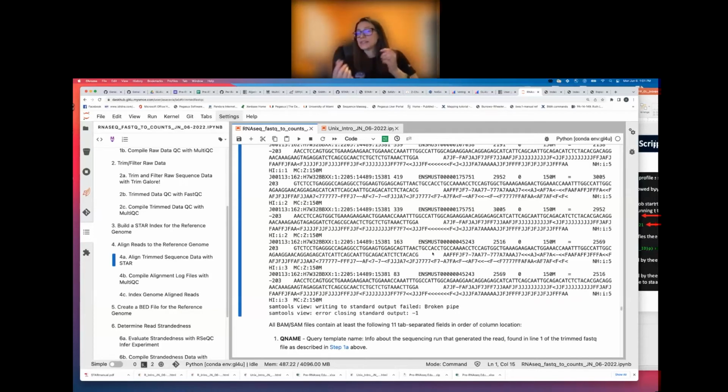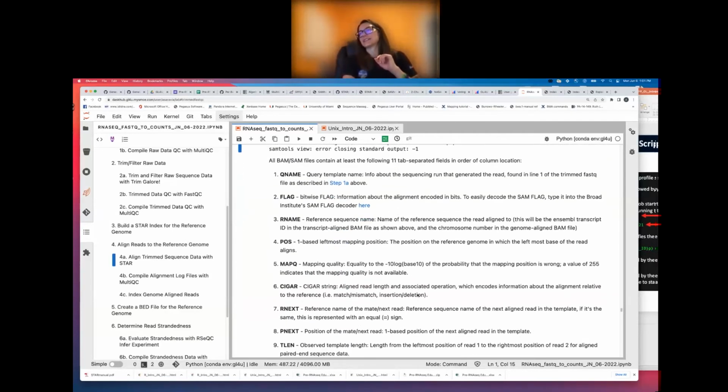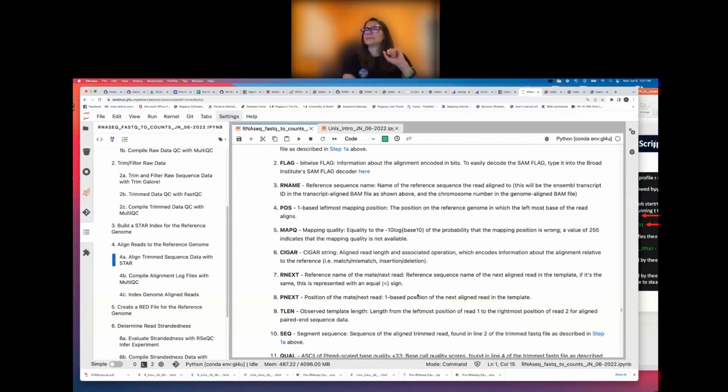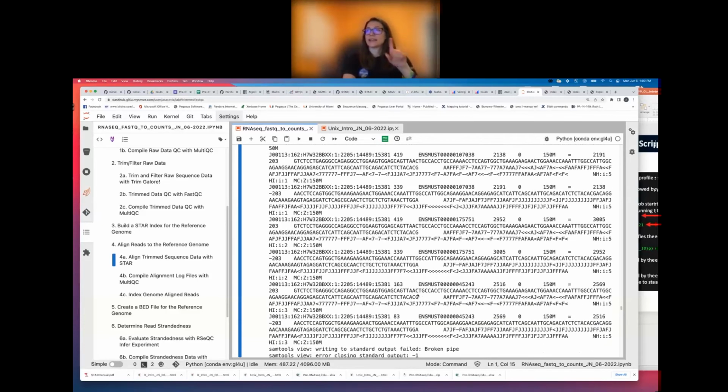Sometimes it can help, because sometimes one location has more of an exact match than another, but not always. Sometimes it'll be the same number of matches in the other location. So it's a little tricky. We'll get into how we deal with multi-mapped reads when we talk about quantitation. Any other questions about identifying mate pairs, and the transcripts they map to, in a BAM file?